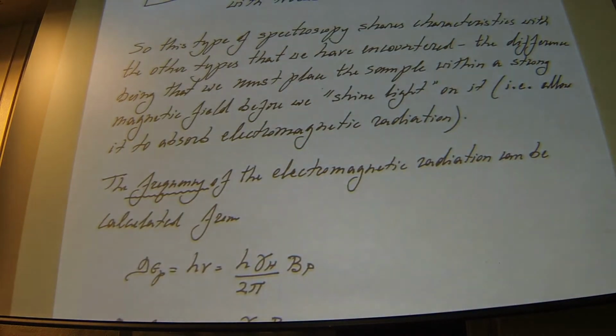Now, to recap, it's not any different from any other spectroscopy. You have a sample, you shine electromagnetic radiation on it, it absorbs a little bit of it, you measure what's absorbed, and the absorption versus frequency gives you the spectrum. Same here. The only difference, here there's a magnetic field. Why is there a magnetic field? Well, because if you don't have that magnetic field, then the energies of those two spin states are identical, and there's nothing to measure. So in order to measure a difference in energy, you have to put them into a strong magnetic field, so plus 1/2 and minus 1/2 spins are separated by some energy. Stronger the magnet, the bigger the energy separation.